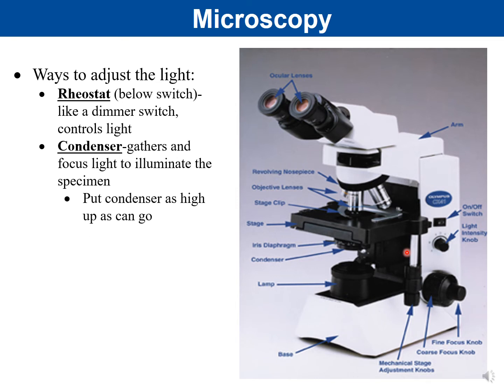There's a knob on the other side of this that you usually don't have to move often. On this black box on the other side, there's a little knob, and you can adjust the height of the condenser. And so normally we would start with the condenser as high as it would go. Usually we don't adjust the condenser to adjust the light intensity. That's probably the least common way to adjust the light intensity.